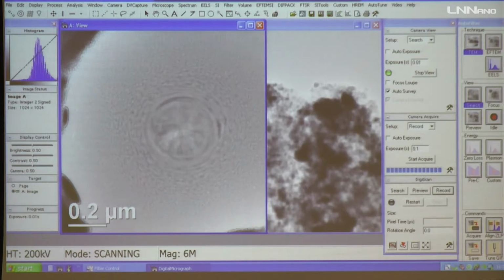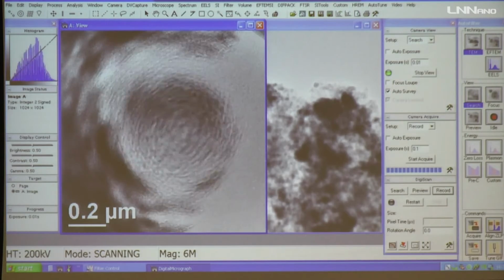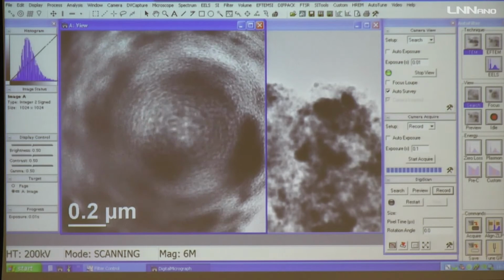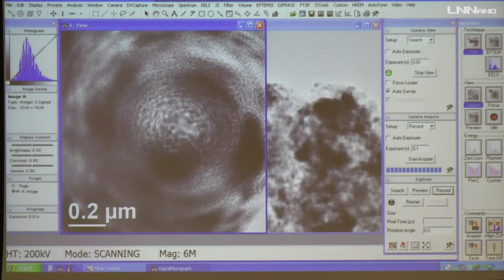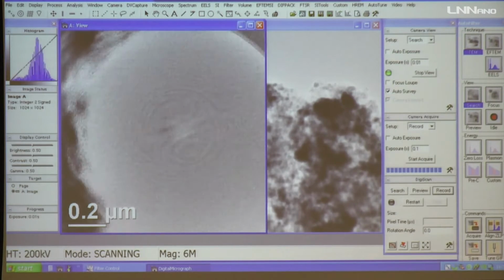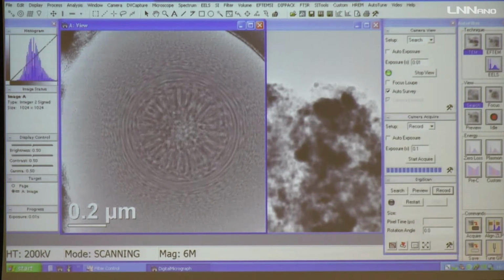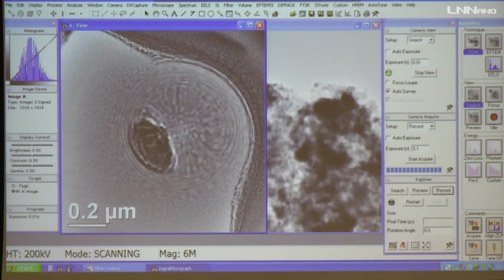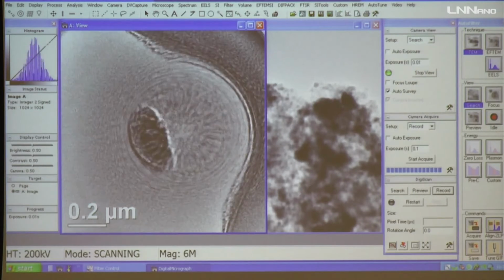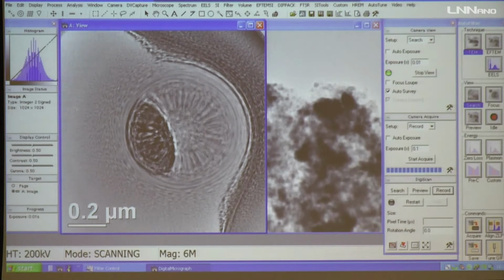They appear very strange. Let's see. Here you are on the material. You see? It's not that understandable. Well, coming back here, it's clear for you the idea of the inversion. When we approach the material, it starts to appear in the other side.